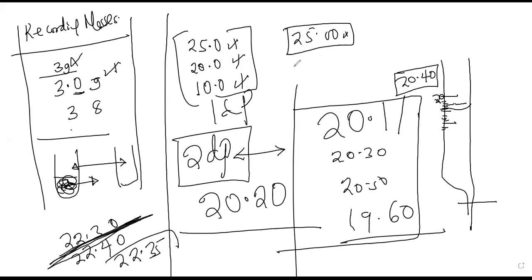However, do the practical. What the practical gives you is what you record. But to me, it is safer to end with a 0. You can rarely and barely make mistakes, and you can maintain the accuracy very well when you end with a 0.